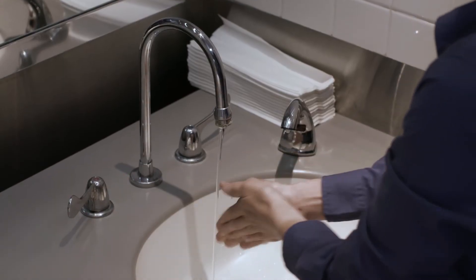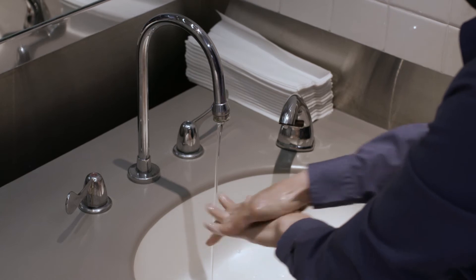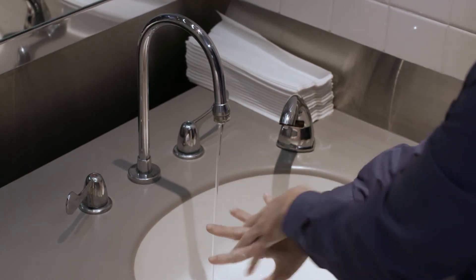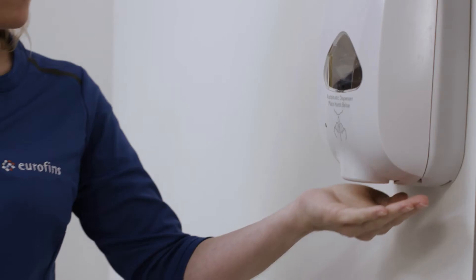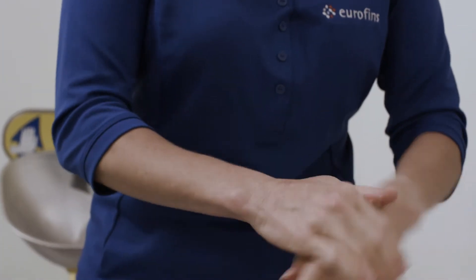Before putting on your PPE, begin by washing your hands for 20 seconds in clean soapy water. If a sink or hand washing station is not available, you may apply hand sanitizer.